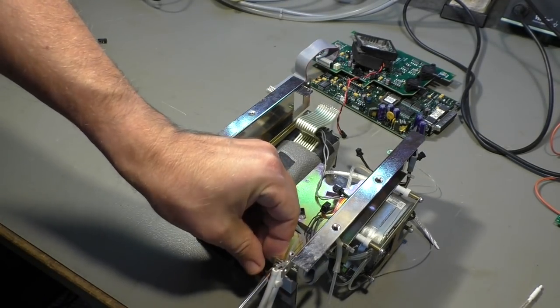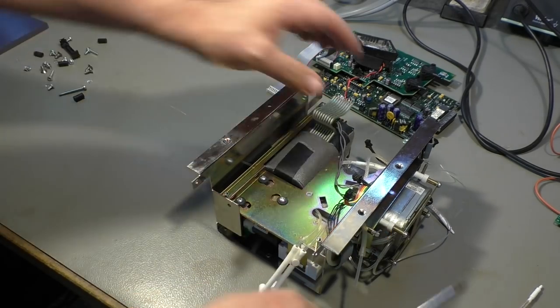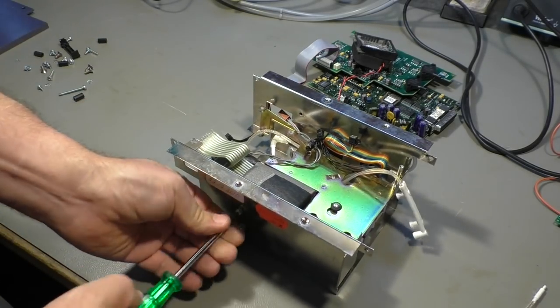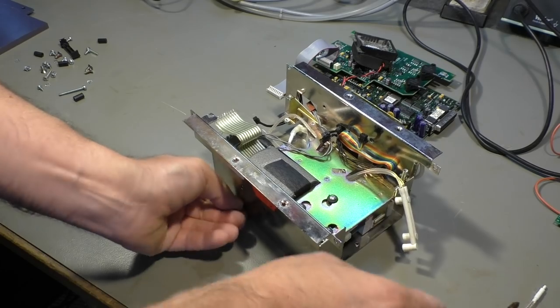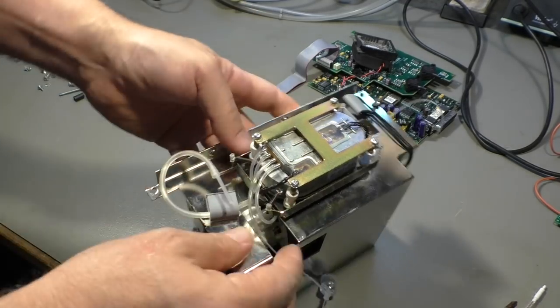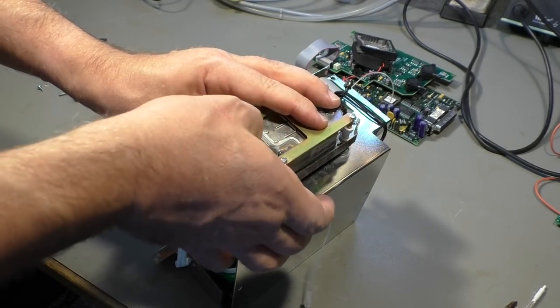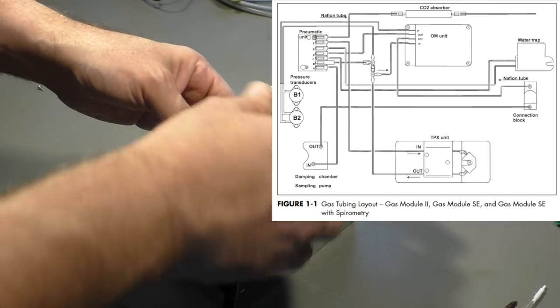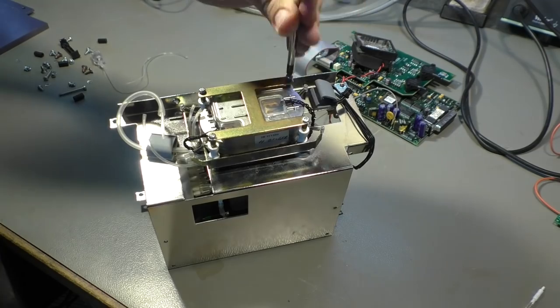And where is all the rest? Where is the physics package? Because the electronics package is not so exciting. There are more screws. It's an interesting design. They have screws all around. Everything is screwed together with everything. Okay, now we can get that out. Now there are hoses attached, so we have that strange part here with four. That's just cheap, I don't know what plastic. It feels a bit like silicone, but I think it's something else. So that comes off like this.